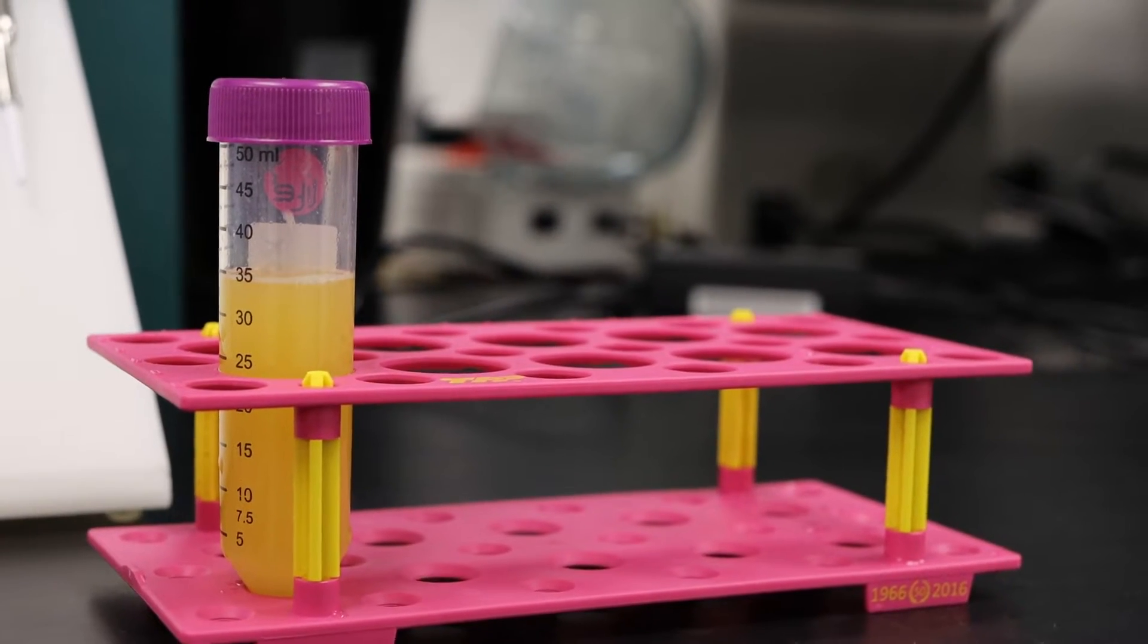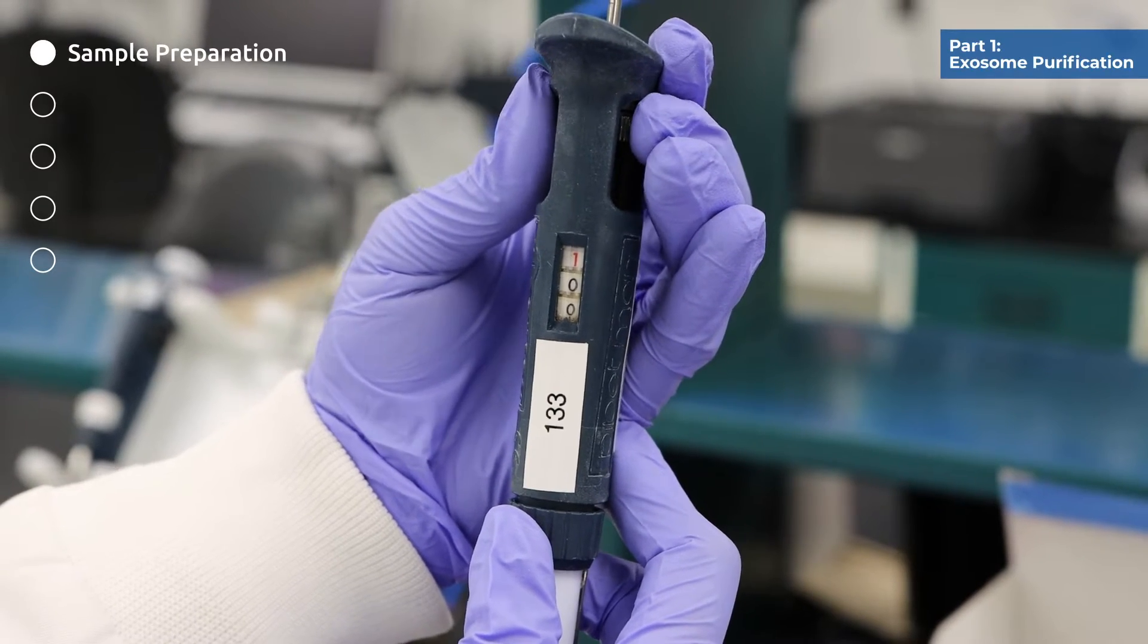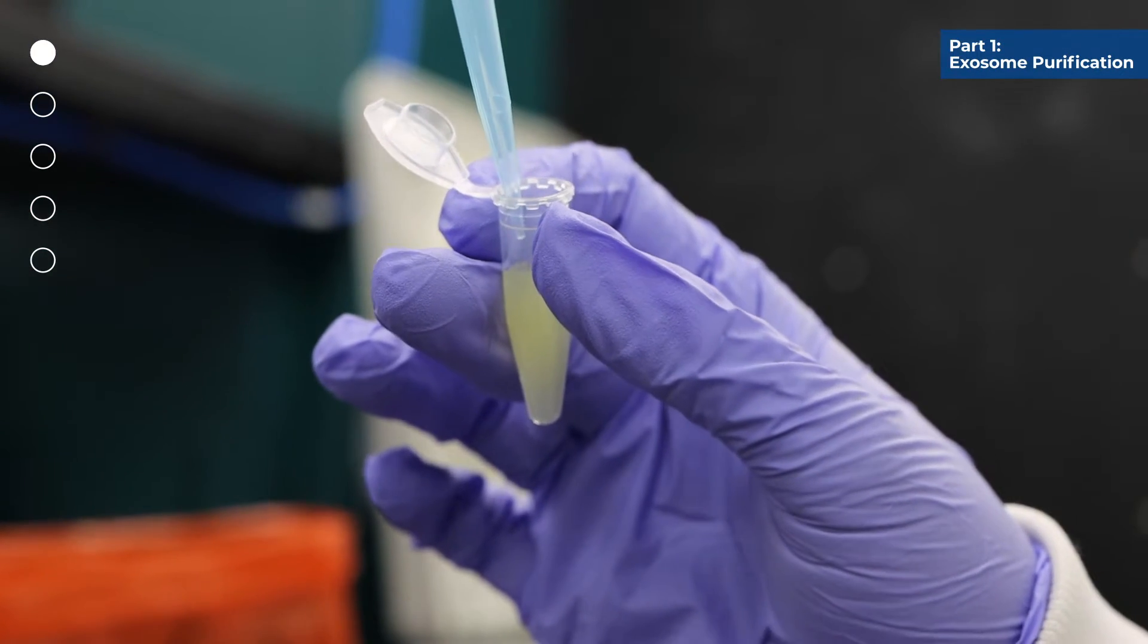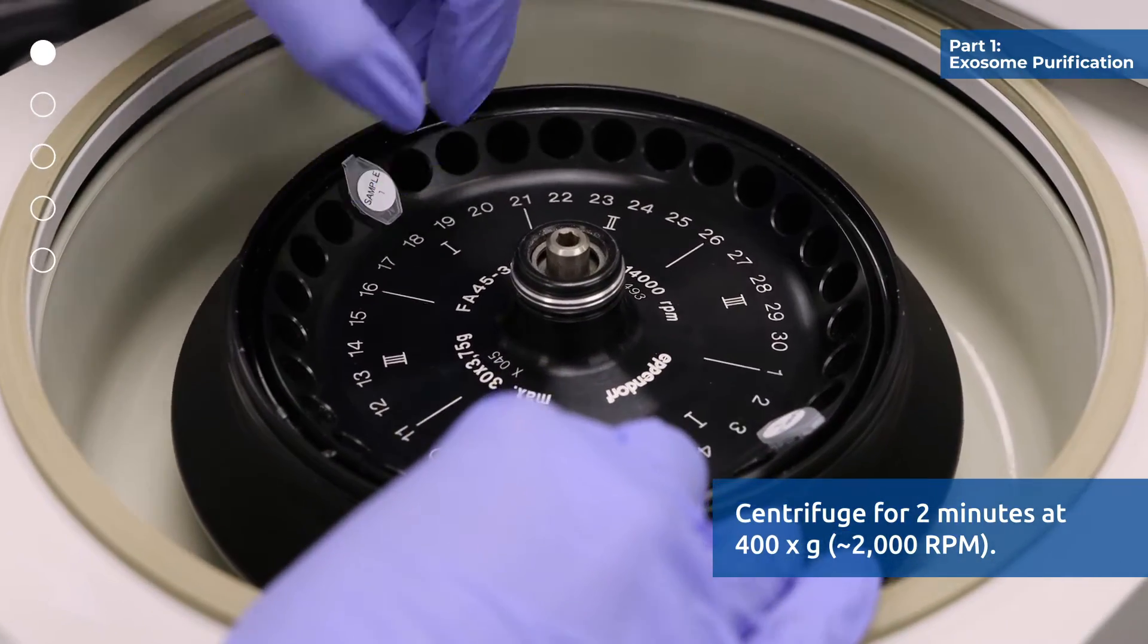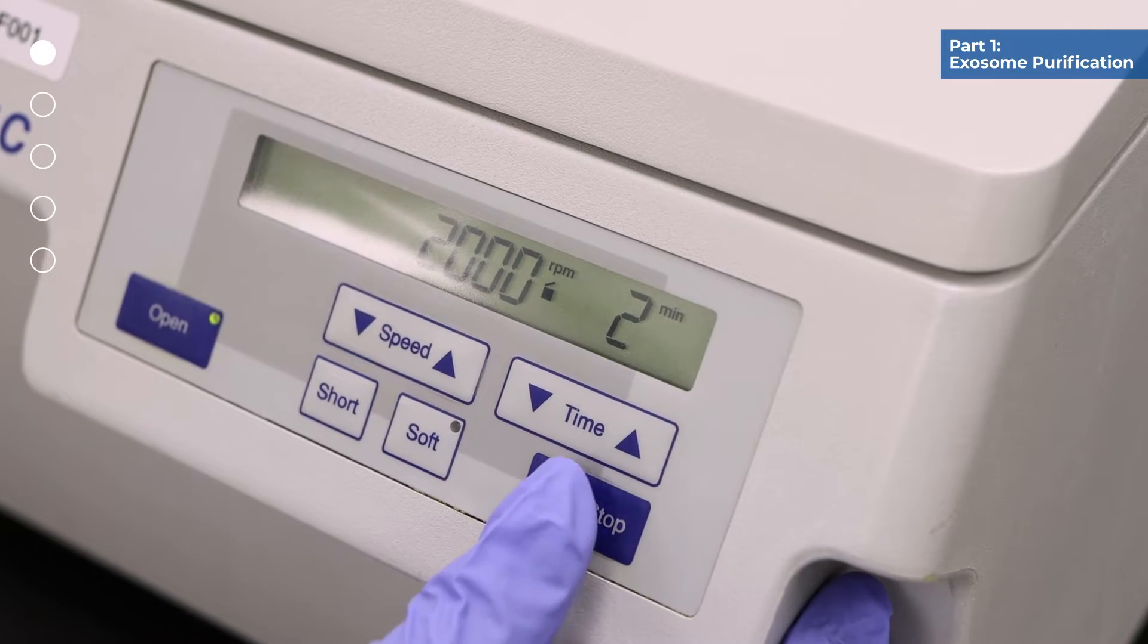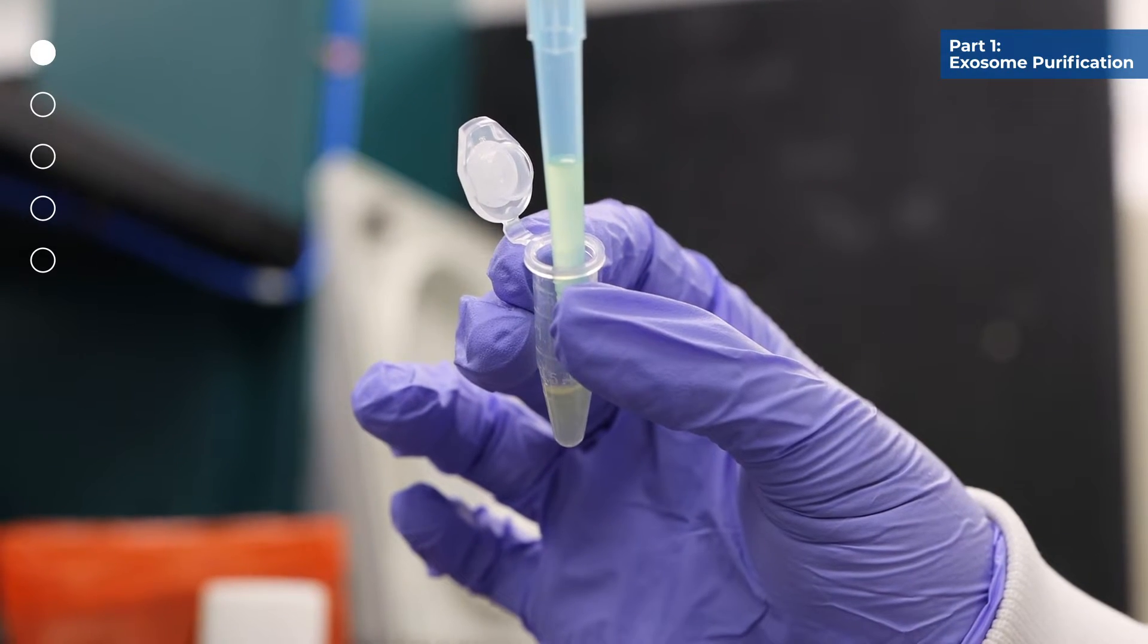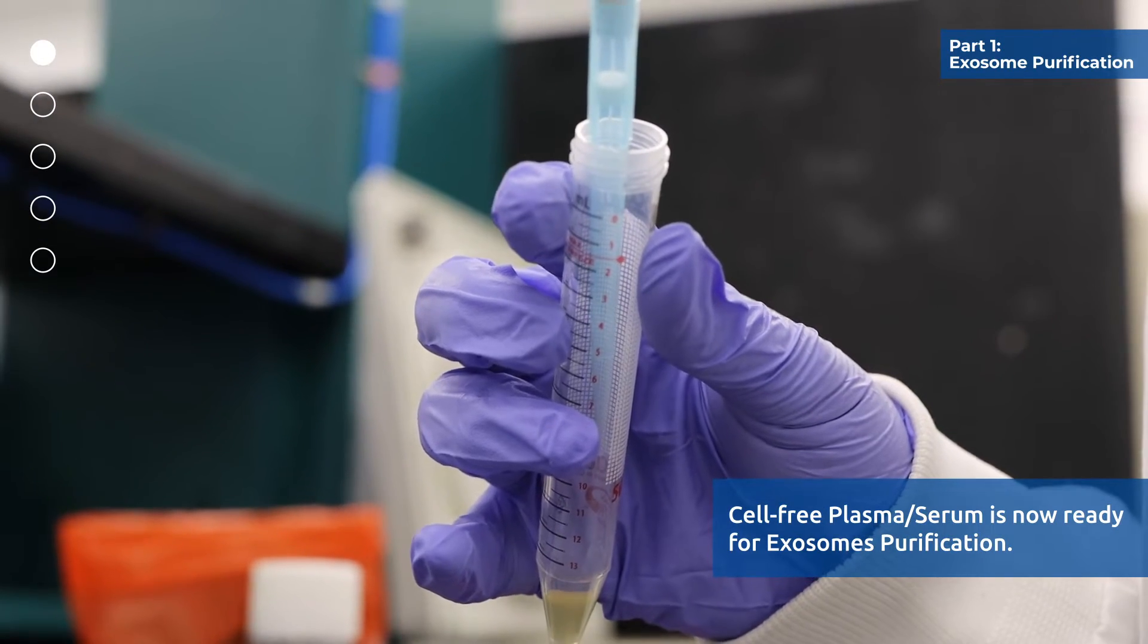Place your frozen plasma serum at 4 degrees Celsius to thaw. After thawing your plasma serum sample, aliquot the volume to be processed and centrifuge for 2 minutes at 400 g or 2000 rpm. After centrifugation, transfer the clear plasma serum supernatant to a fresh tube. Cell-free plasma serum is now ready for exosome purification.